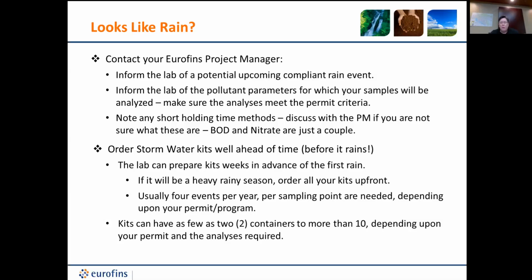There's a lot of them. BOD is like a 48-hour holding time. pH is supposed to be a field test. Nitrate's a 48-hour holding time. There's certain methods that you need to get to the lab as quickly as possible. And understand this, when you guys are dealing with the lab, any lab, not necessarily just Eurofins, when it rains, everybody out there who's under a permit is probably going to be sampling. And a lot of those samples show up at one lab at a time. So if there's a lot of stuff coming in that's short hold, labs only have so much capacity. So that early communication, that contact with your project manager at your lab, gives them a heads up that it's coming and allows us to better service you.